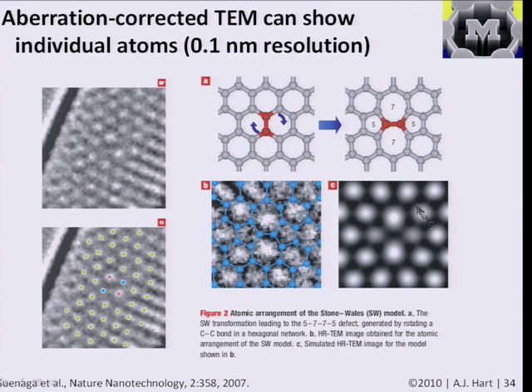And it's also more difficult to do this for atoms that have lower atomic numbers or lower, you could say, lower atomic weights, because an electron beam of a certain energy that may be more effective at imaging will be more likely to damage a more fragile or lower atomic weight material. So you need to have a better image at a lower accelerating voltage, for example, to image something like carbon, whereas you might be able to use a higher voltage or a higher current or a higher beam intensity to image something like zinc oxide or a metal.